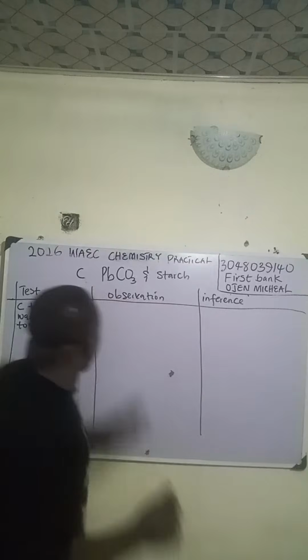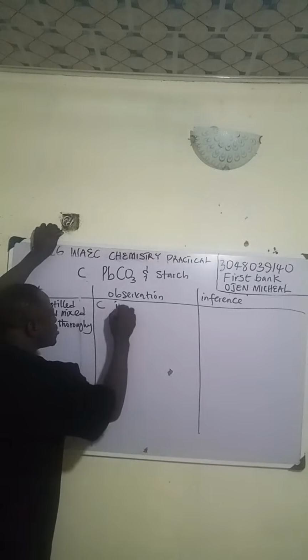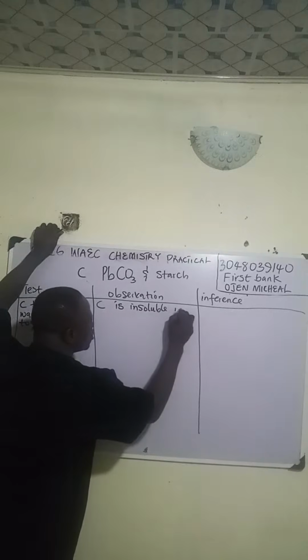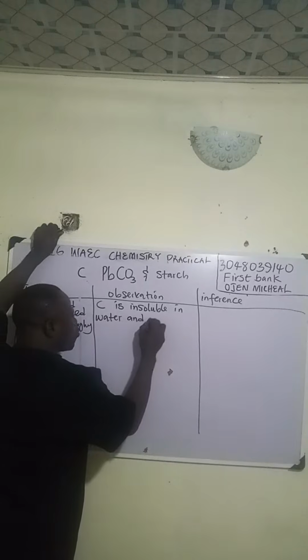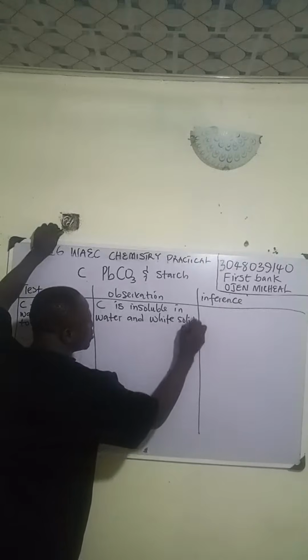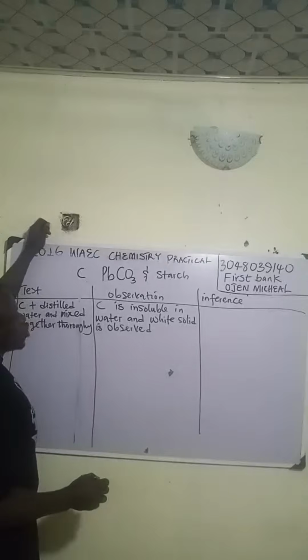Are you following? Now, since it is like that, when you mix it like that, what you are going to see is C is insoluble in water, and a white solid is observed. This is what you are going to report.